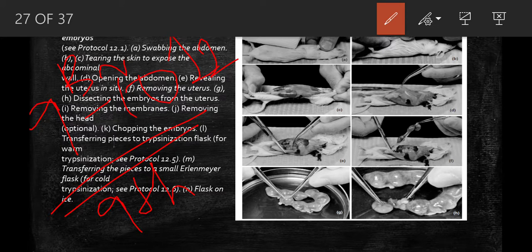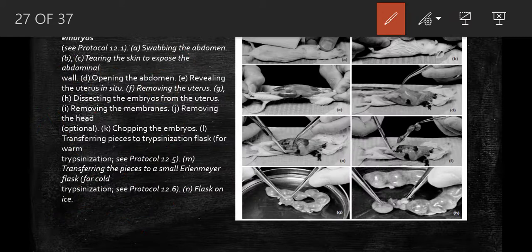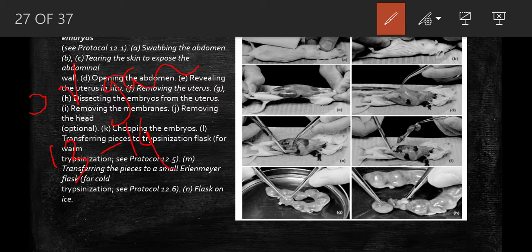For dissection of organs, it is easier at the 13th or 14th day, and most organs are formed by the 18th day.